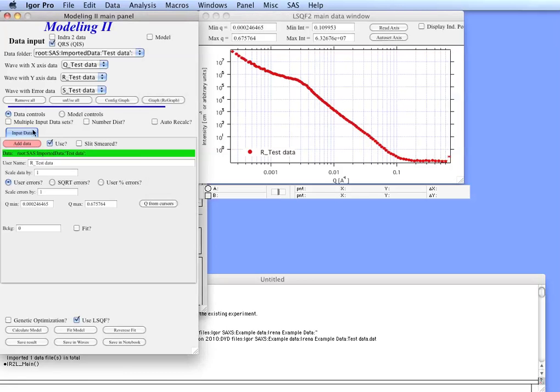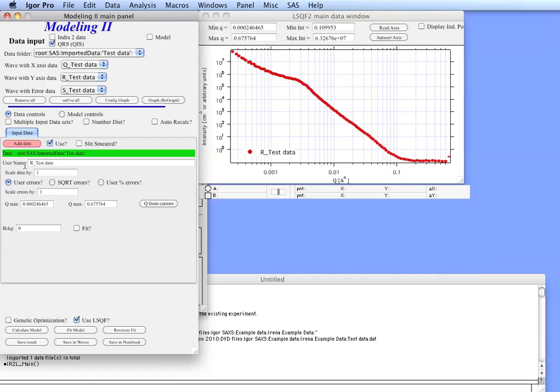Now what happened was that the data were loaded in the tool. You can see that we have the use button here checked. We have the name which we can change here so you can put in whatever you want that will be displayed in the panel.